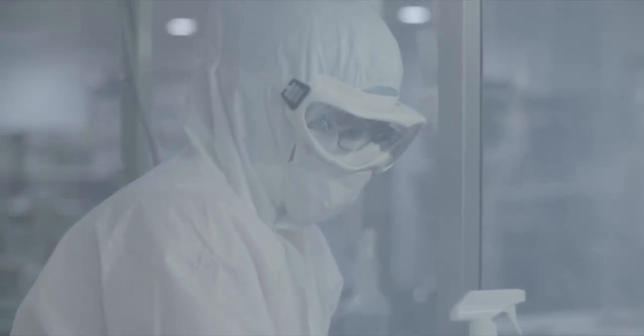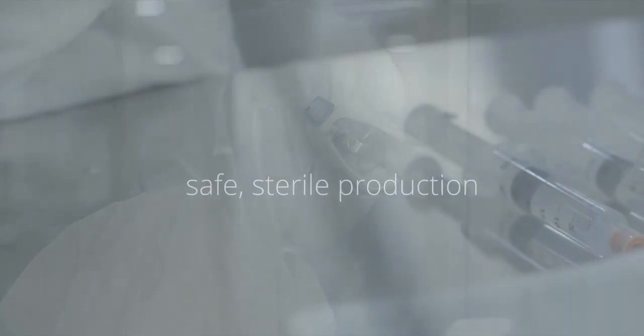In fact, Avella goes above and beyond to ensure a safe, sterile production environment.